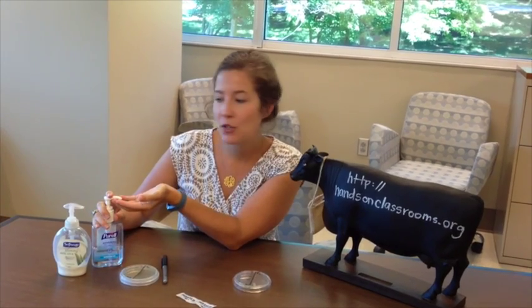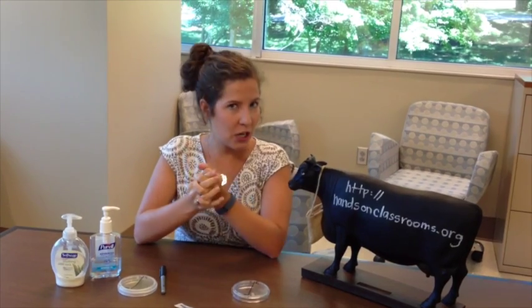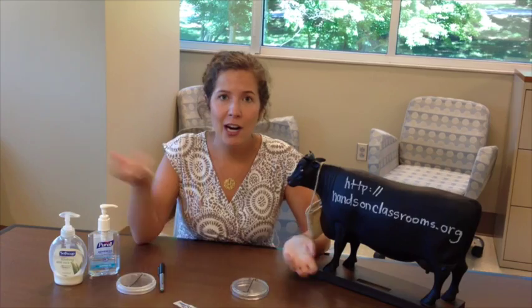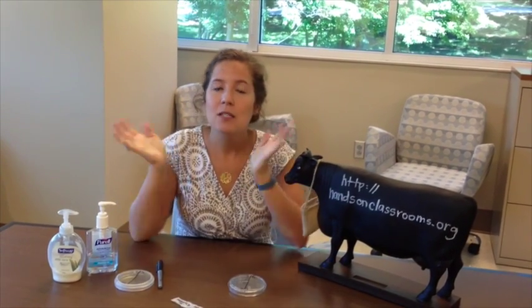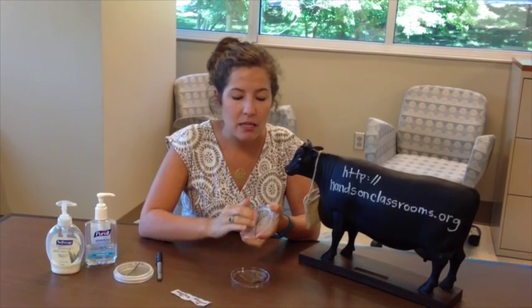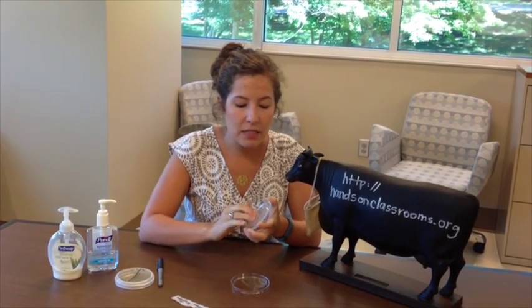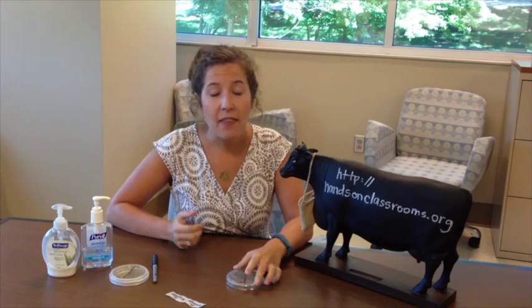Then we perform our treatment. I'm doing the hand sanitizer. If you use the hand sanitizer, make sure that you let it dry completely. Otherwise, you might kill the agar and then we can't grow bacteria. So once my hands are good and dry, I'm going to touch my clean hands to the treatment side where I have my T, using that same technique and rubbing my fingers all over the T side.